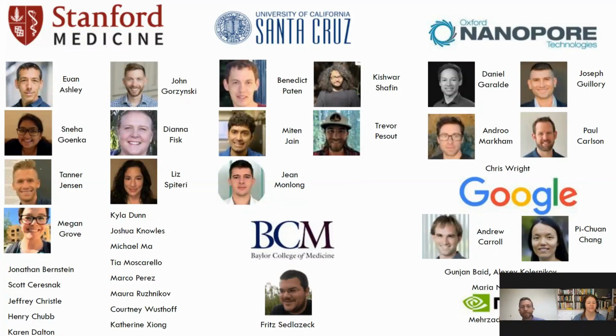Great, thank you. Next question. What kind of nanopore sequencing did you use? I have used MinION sequencing before for sequencing T. cruzi and used the de novo assembler Miniasm Minimap. We found these tools were much faster than Canu assembler. What de novo assemblers have you used?